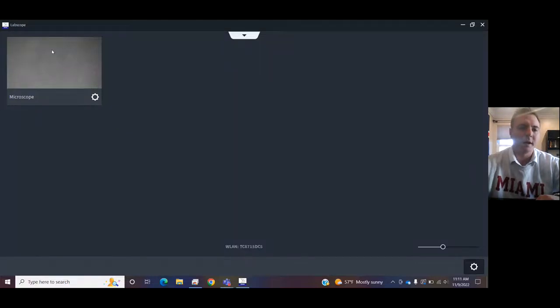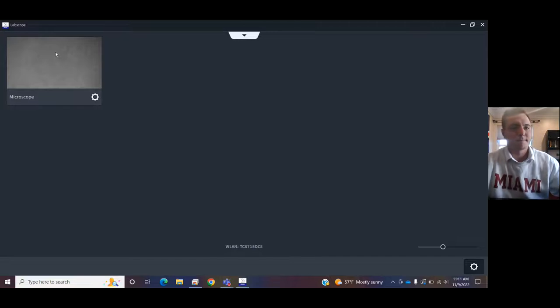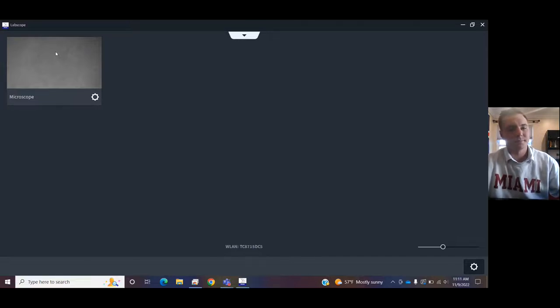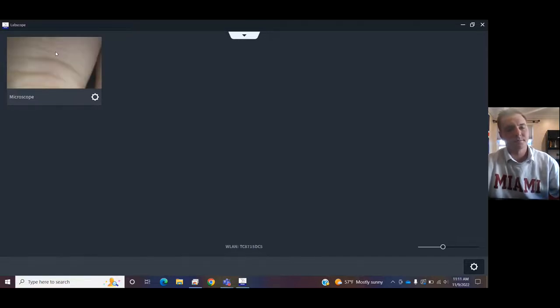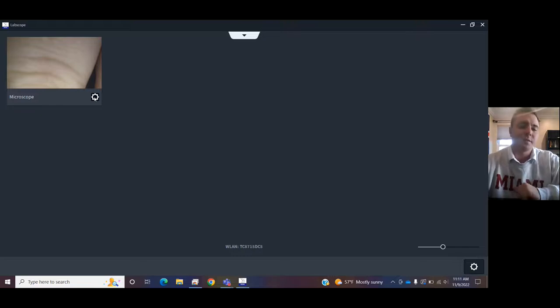You see here we have our live image. Wash my hand under it.